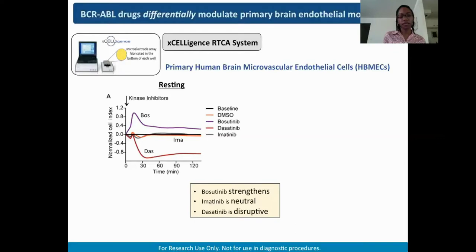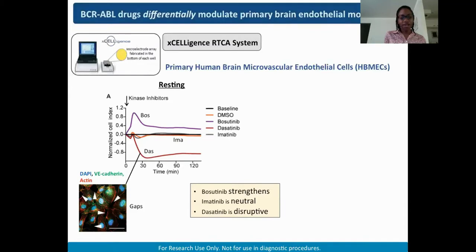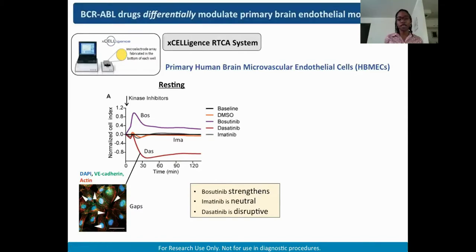We examined the effects of these kinase inhibitors both by Agilent RTCA assays and immunofluorescence microscopy. Dasatinib-treated cells stained with DAPI, VE-cadherin, and actin showed lots of intercellular gaps forming between cells, matching what we saw in RTCA assays. This was a surprising result — we expected all three BCR-ABL kinase inhibitors to behave similarly since they were designed against the same target, but here we observed these divergent phenotypes.